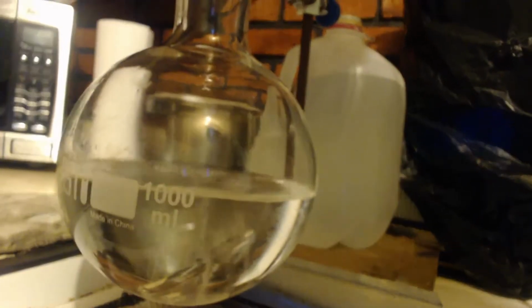You can see it's boiling up there. We get a good look. There's the receiving flask. You know, it's not going super slow. First distillation, I went quick. I'm amazed I got that good of a percentage. I thought I'd get like 80% or something because I was going so quick with it. I mean, it was a lot.